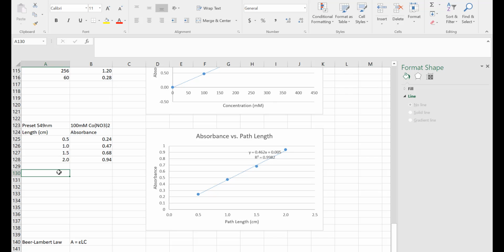So what I can do here is start off with that equal symbol. I can tell Excel the next thing I'm going to type is actually a formula. I can use the maximum formula. It's telling you here it's going to return, in a set of values, which one is the biggest. I'm going to put a bracket around, and I'm just going to highlight over these values here, and right away it's known.